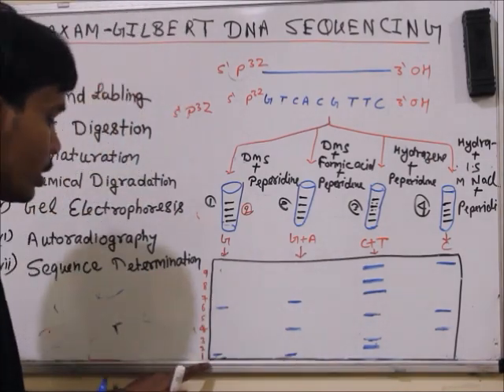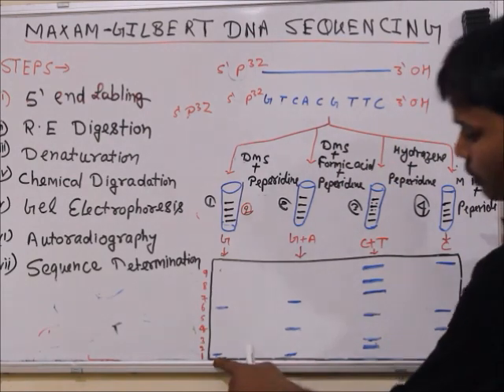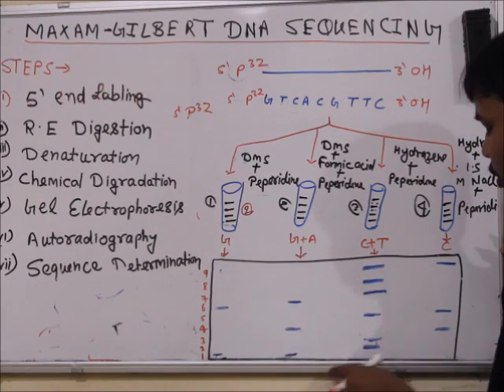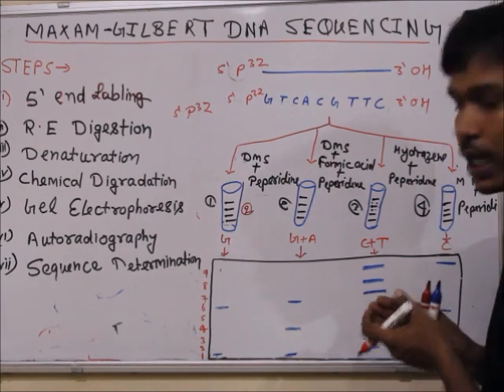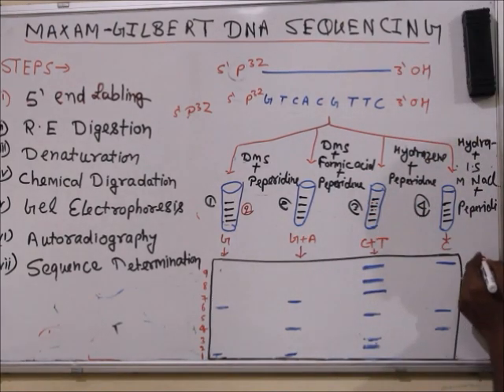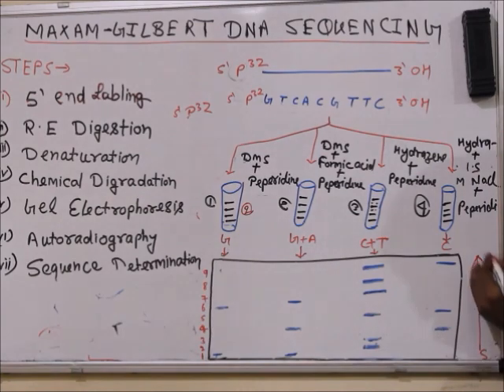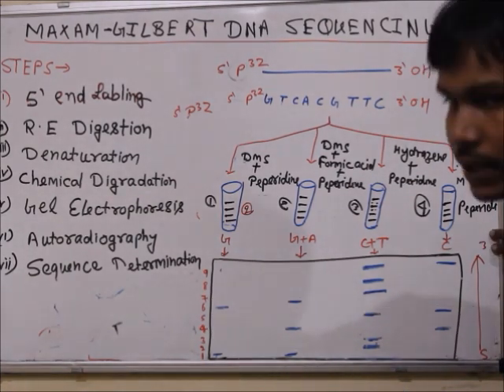So this is the one where the number of nucleotides is 1, so there is longer traveling, and in the first position, and the second position, you will see here that on the basis of length there is traveling of the nucleotides in the gel electrophoresis. So there is what? 5 positions, G, there is 5 prime and that is 3 prime.